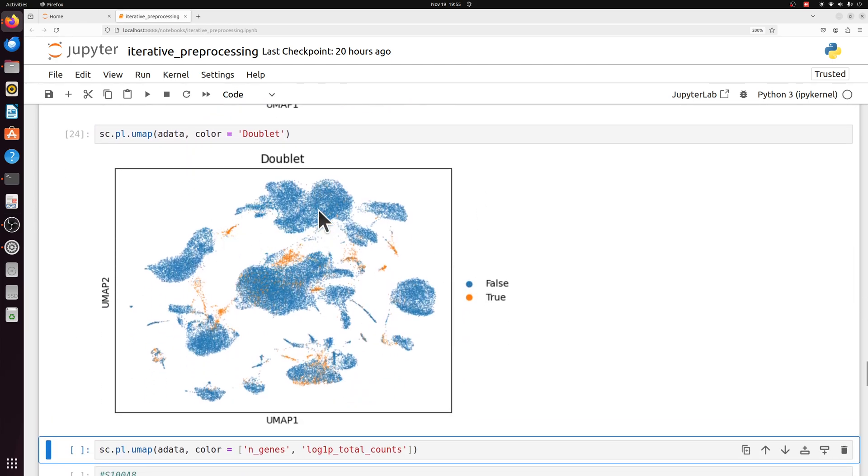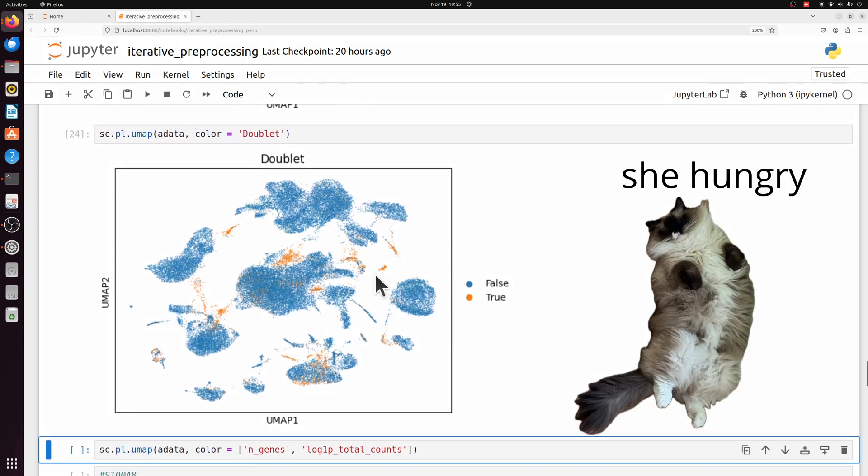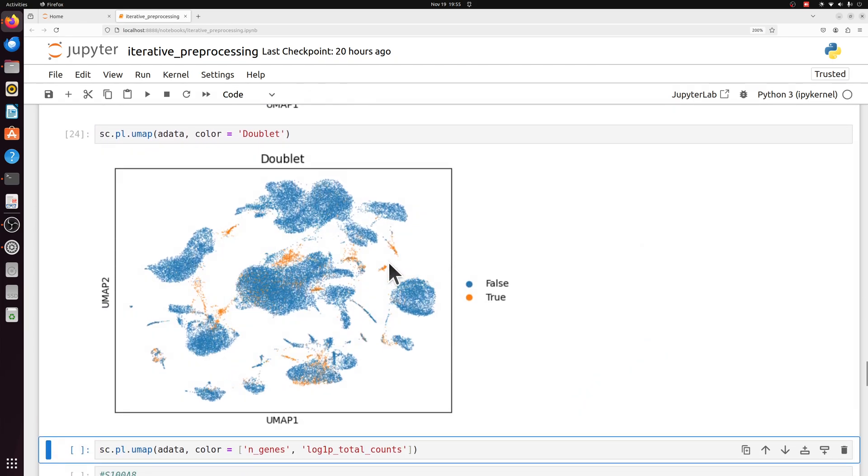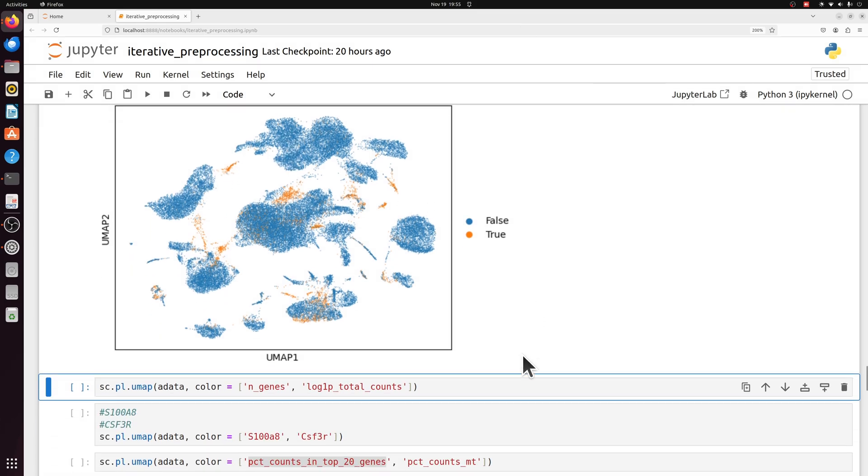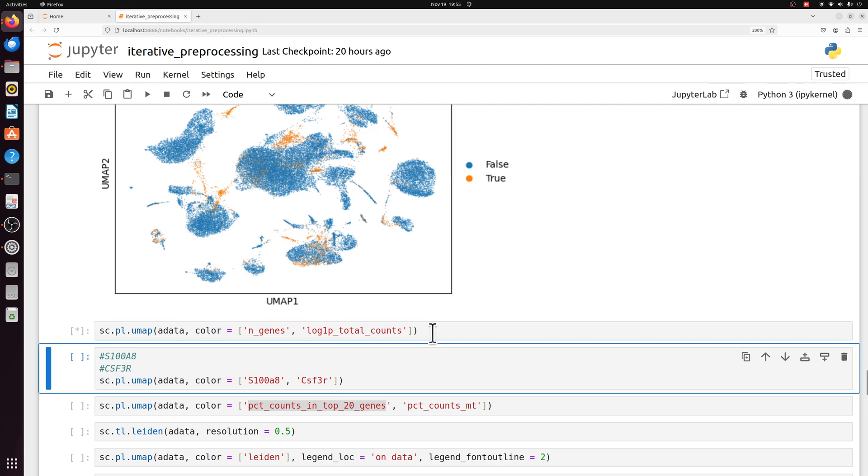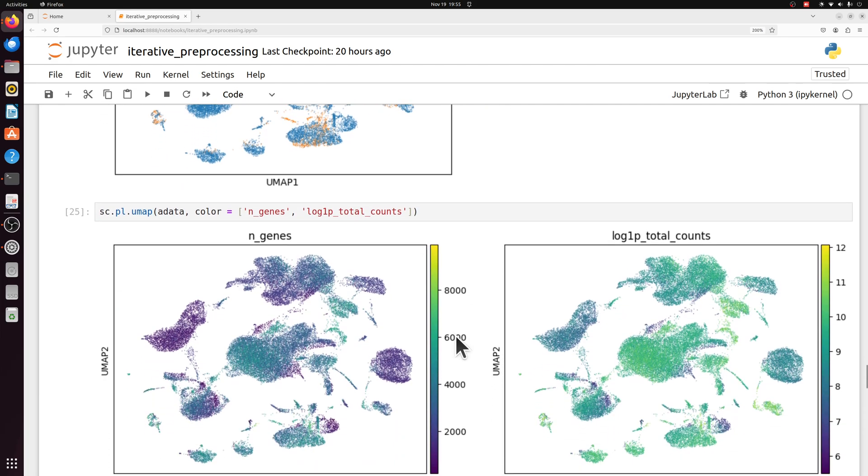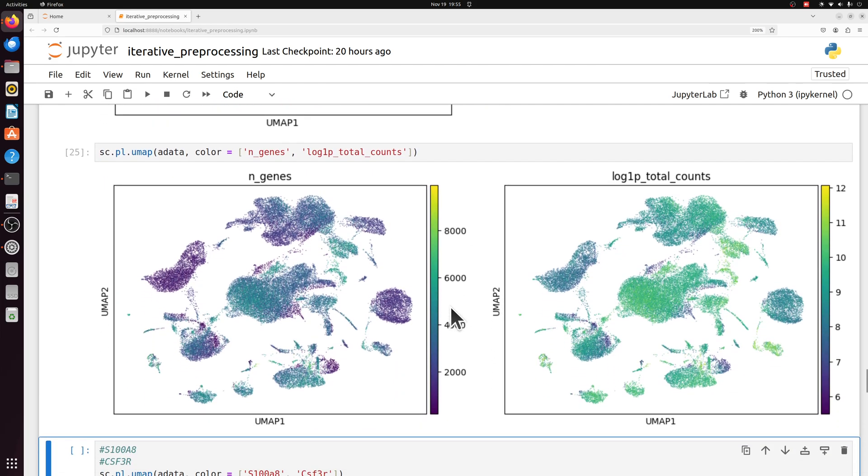Doublets. This is more or less what we expect. There are some of these clusters that are primarily doublets. But there are these little ones that are pretty typical of doublets. And one of the reasons I picked this data set is because one, I know that it has neutrophils in it. And two, it has a very large dynamic range in the number of genes expressed in some of these cells.